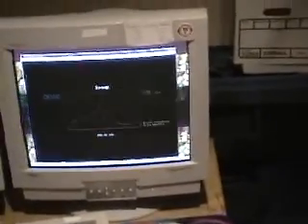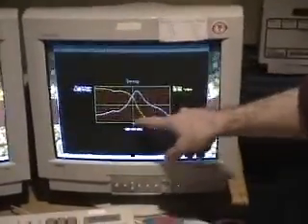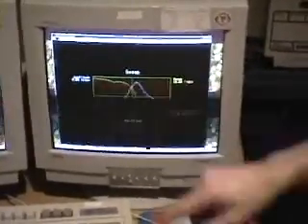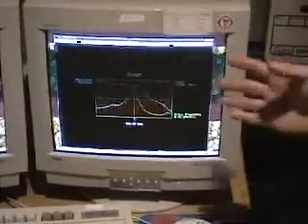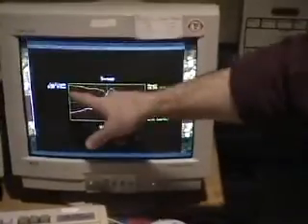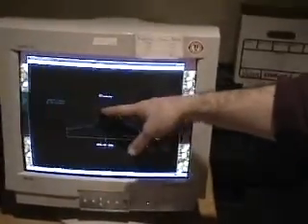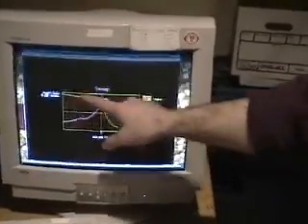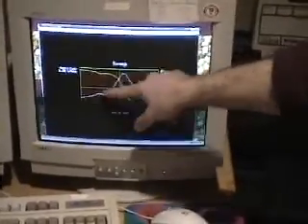And those of you who have taken Physics 213 know that as we go through a resonance, if we're mapping amplitude versus frequency, we should see a maximum in the amplitude, and we should also see that the phase changes by 180 degrees as we go through a resonance. This cantilever has many different resonant modes, so in fact in this case we're going from positive 180 degrees down to 0 or something like that on the phase, but the most important thing is that it's changing by approximately 180 degrees.